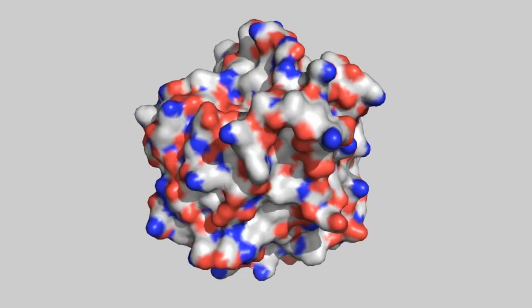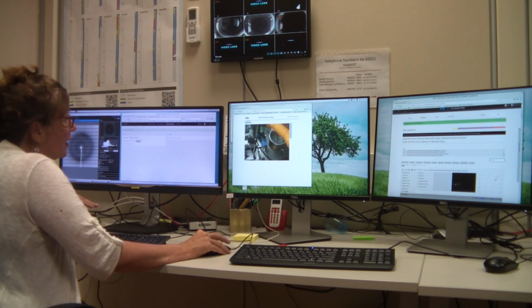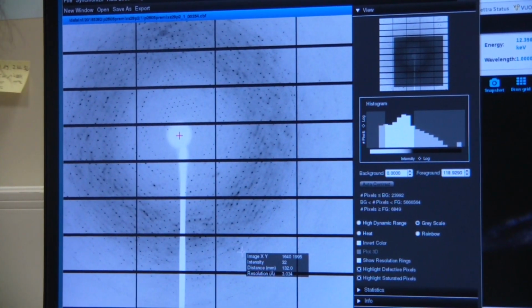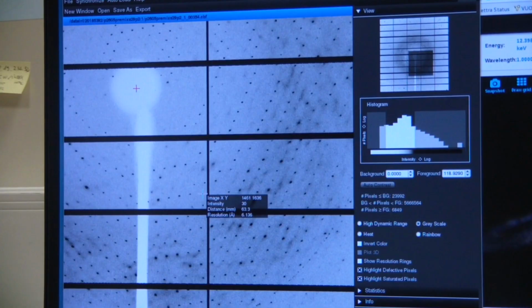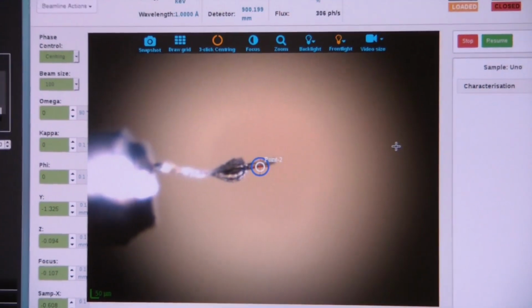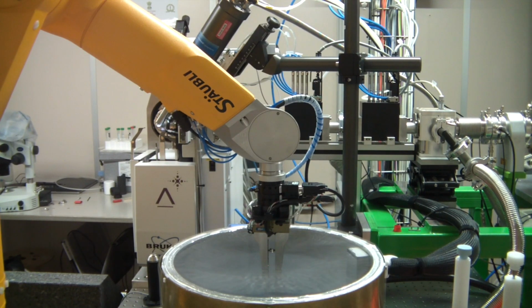The users coming to this Beamline are very used to going to other synchrotrons and performing this type of experiment. What we really aim at with this Beamline is to have those users be as comfortable as possible, so having the same kind of software to collect and visualize their data. We are very in tune with the other synchrotron community, and we have collaboration for software. So a user that arrives here already knows how to collect data and can be very productive very fast. Our typical data collection on a sample is around 10 minutes.